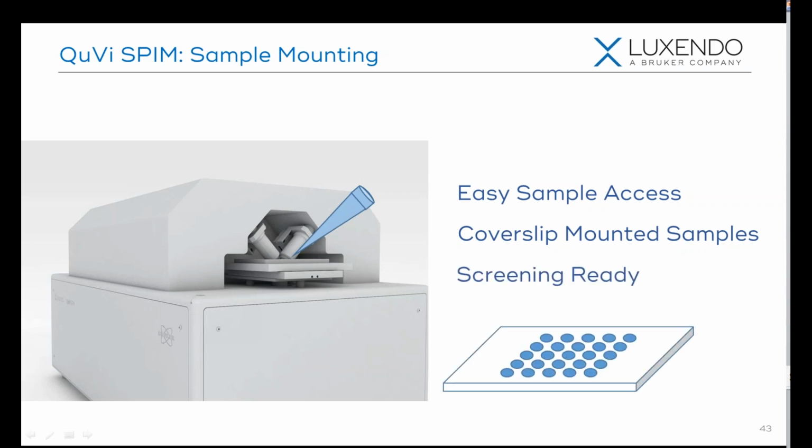And this system is also compatible with SBS format plates, which we could spin down, and you could essentially have a high throughput screening format available to you.